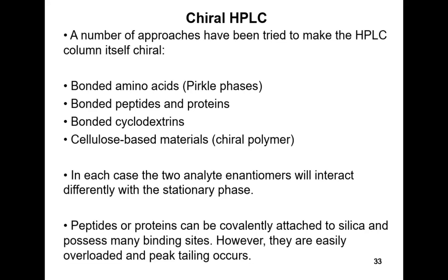So what's going to happen is when the sample molecules interact with the stationary phase, they're not forming a covalent diastereoisomer, but they're forming non-covalent complexes which are diastereoisomeric to each other. So there'll be a different combination of non-covalent interactions depending on the orientation of your sample molecule. I also try and illustrate that with the amino acid example.